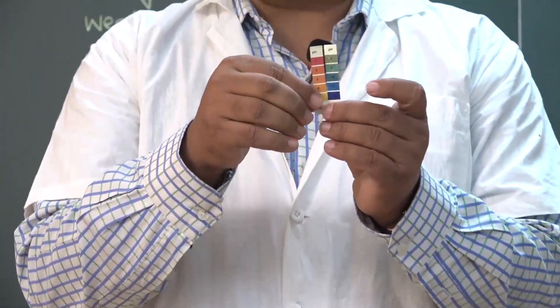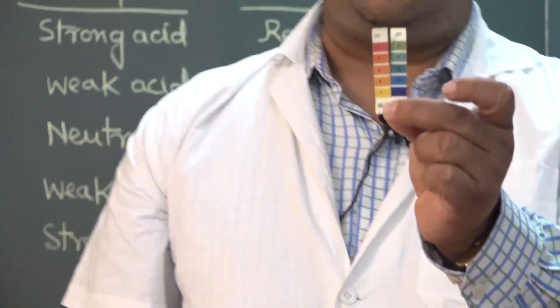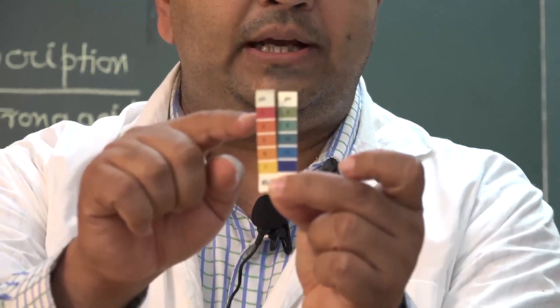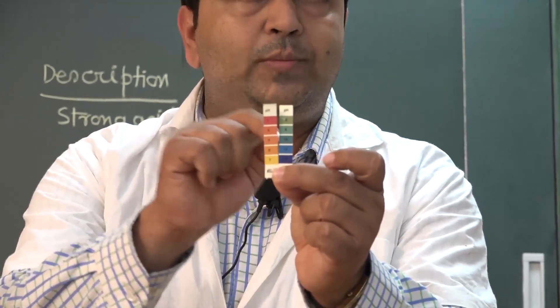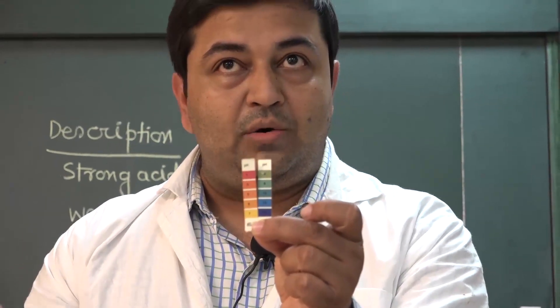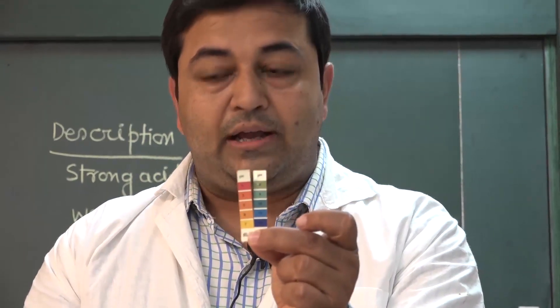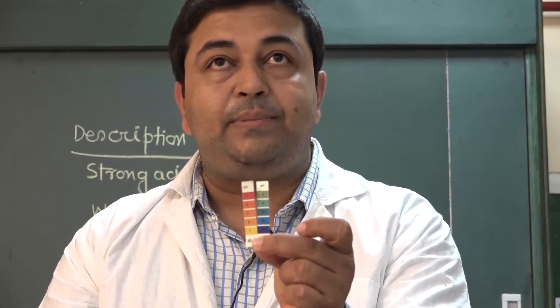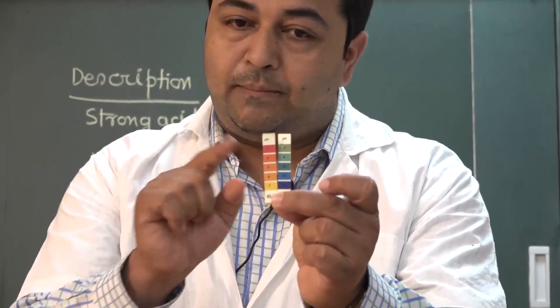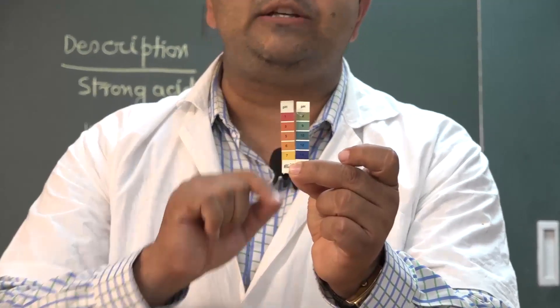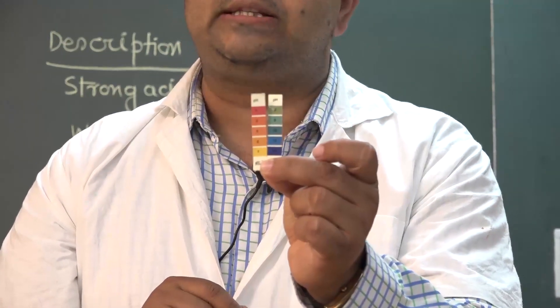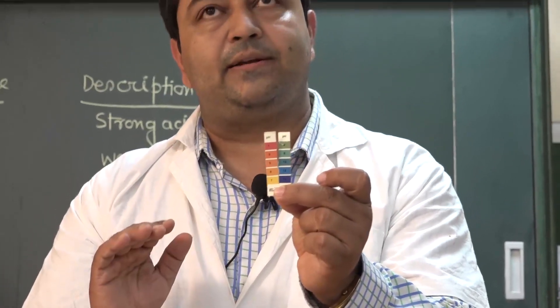This is the pH scale. At each particular pH value there is a corresponding color, and everything is mentioned on this pH paper. Now one by one we will collect the pH paper from each solution and match its color with the pH scale. From that we can determine whether the solution is acidic or basic.